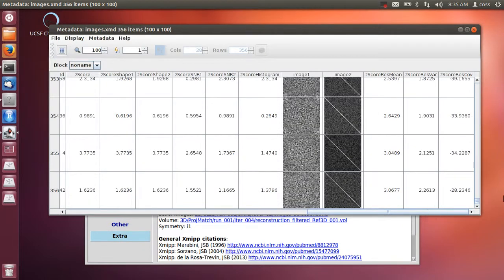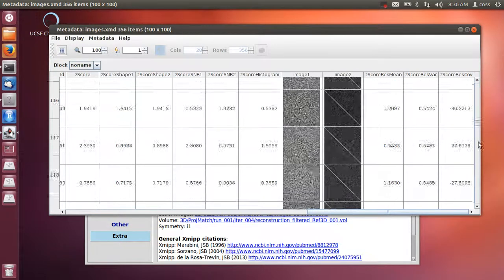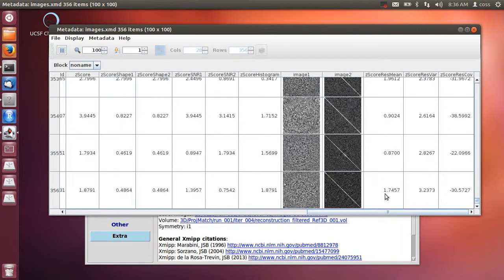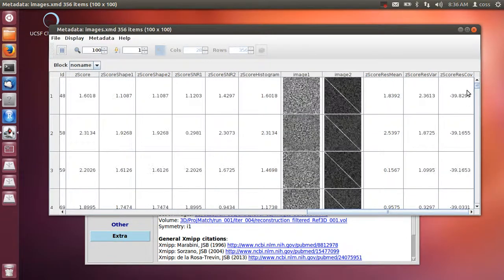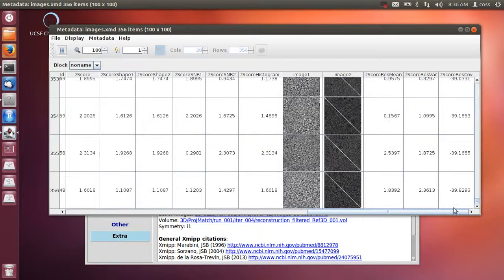Normally a standard threshold for the score is about 3, and this comes from the Gaussian: 99% of the volume of a Gaussian is contained between -3 sigma and 3 sigma. So here you see all these images are presumed to be pretty normal, and this score is not normalized. There is a paper describing the score, but again, the larger the value, the worse the image is. So these are worse images than those here.